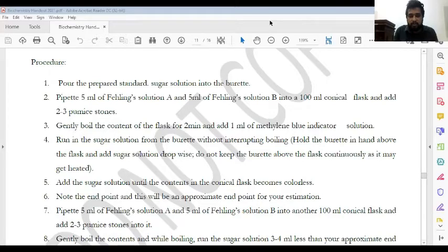Okay. Then what is the oxidizing agent here? The main oxidizing agent? Fehling solution. Then what is the active component of Fehling solution? Specifically Cu2+. Yes, Cu2+. Okay. Then you know the main redox reaction here. Cu2+ will reduce into Cu+, and the sugar solution, glucose, will oxidize into gluconic acid.